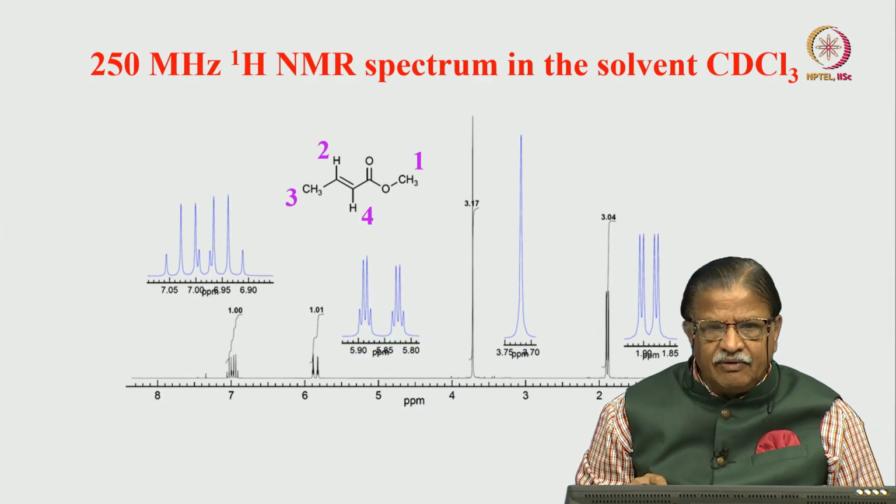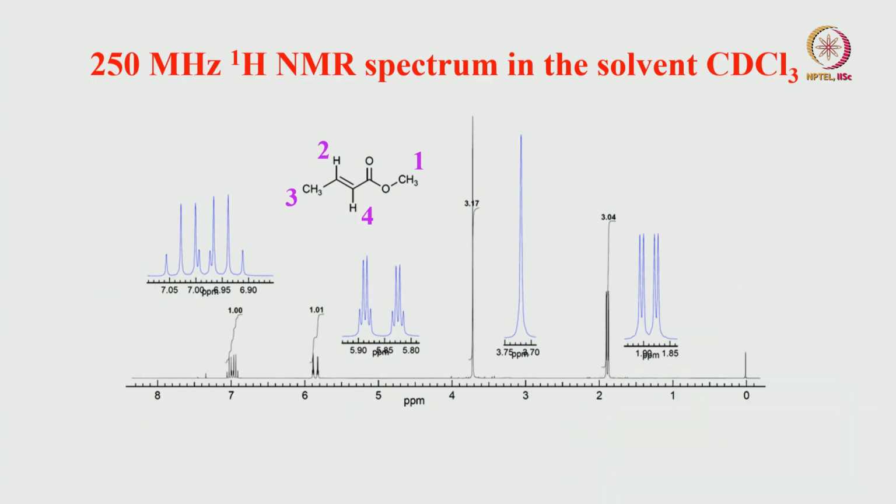We will go for this molecule. Similar molecule, but instead of a proton here, we have replaced this with a methyl group. This will be an identical way of explanation. This CH3 proton is already known, this is CH3, this is proton 1, no splitting, nothing, a strong singlet, it is there, easily I can do that. Then what remains?